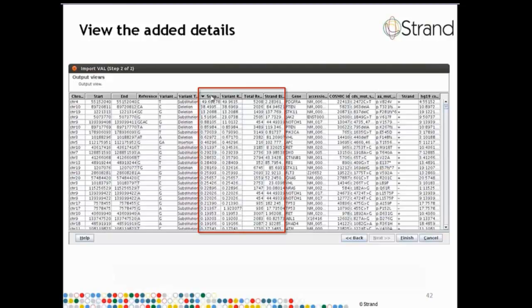So once we have this list, if we sort on the supporting reads percentage column, we can see that there are actually only 3 rows which have any meaningful amount of supporting reads. The very first row, that particular allele has 49% supporting reads, and the strand bias is very low. This is in fact one of the SNPs that was called by the Ion software.